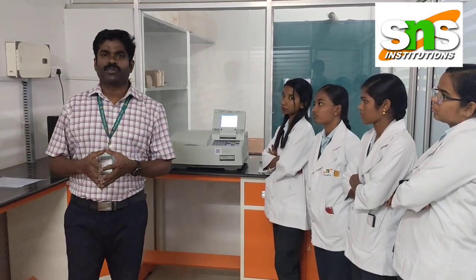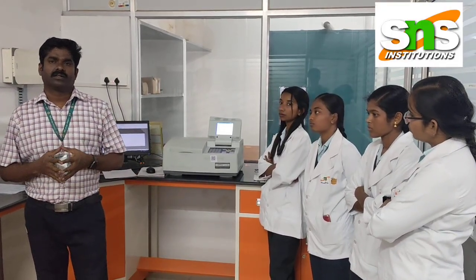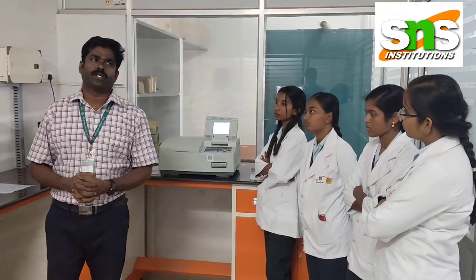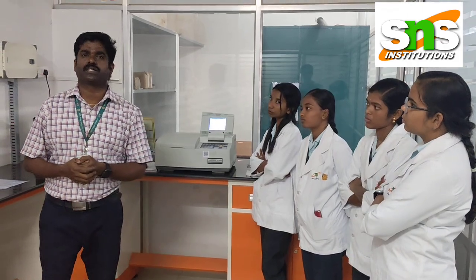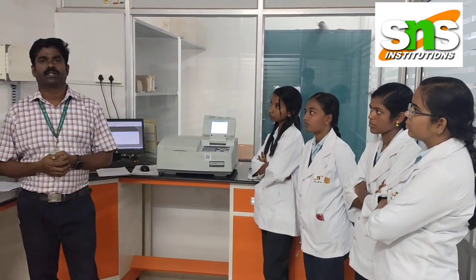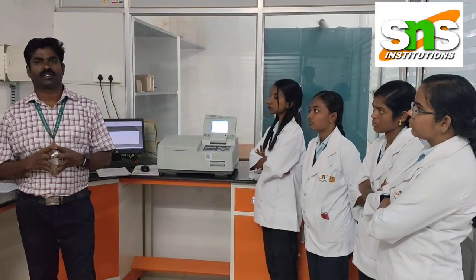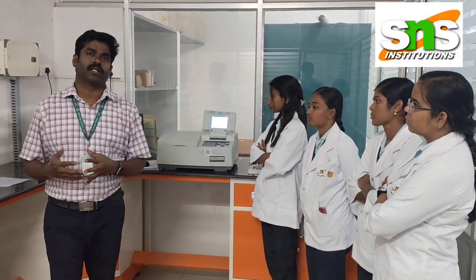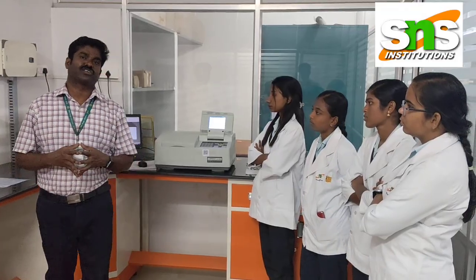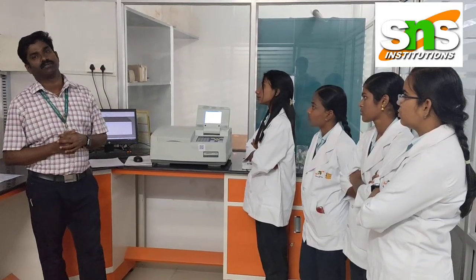Pharmaceutical analysis, or quality control, is a very wide area. In this, instrumentation plays a vital role. We use three major categories of instruments in pharmaceutical industries: one is spectroscopy, such as UV, another is chromatography, and another is electrochemical methods of analysis. In spectroscopy, UV is used for finding the absorbance.